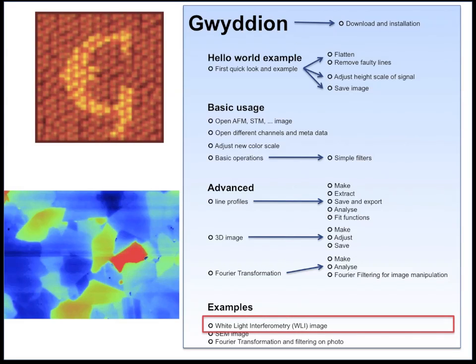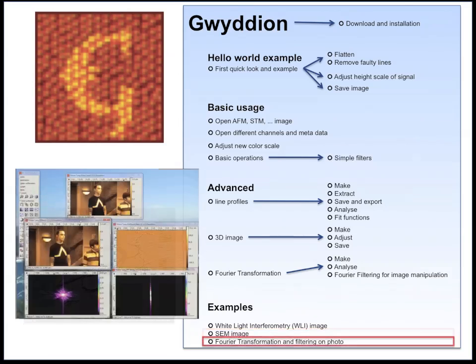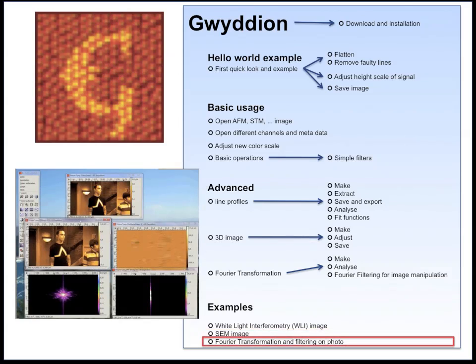Last but not least, I will show you some examples: how, for example, to import a white light interferometry image, a WLI image that looks like this, or how to import an SEM image. And then at the end, I will just import a simple JPEG graphics photo and Fourier transform it, Fourier filter it, and show you what is possible to do with this program.